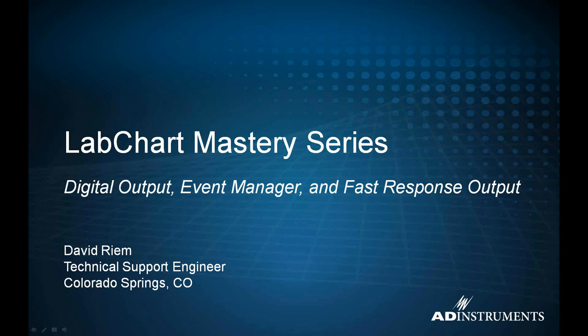Thank you again for attending one of our LabChart Mastery Series. Today we're going to cover digital outputs and inputs, Event Manager, and Fast Response Output. Two of these are extensions that can be added to LabChart, so they're free of charge, but they're additional plugins that you will need to download and install for your software. And digital output and input are actually pre-built in, I guess we could say, for LabChart.